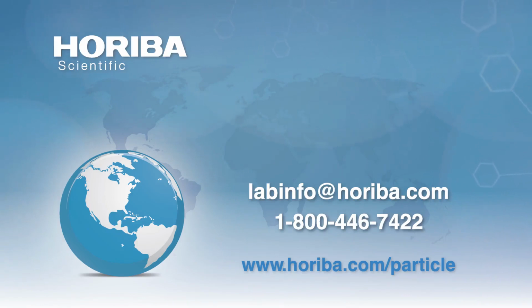And if you have an organic liquid that likes to heat up quickly and likes to absorb, and I'm thinking of halogenated compounds because they seem to like ammonia solutions, which, okay, I'm sorry, that's another aqueous system, but carbon tetrachloride, you really can't do much for data, but you can use things like alcohol. And then if you have simple salts that aren't doing anything optically, knock yourself out.